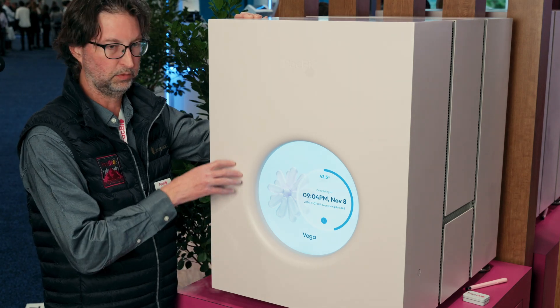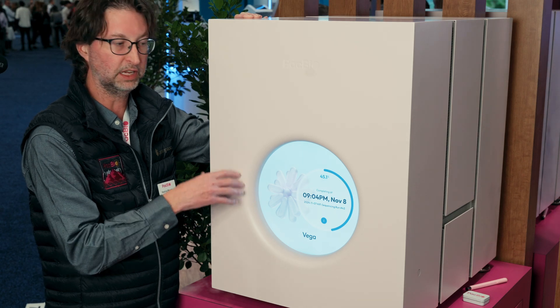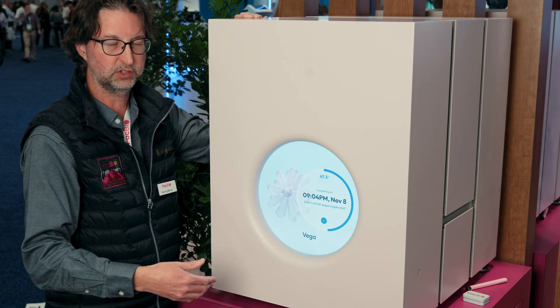As soon as it's done getting the cell sequencing, the used consumables can be removed — it'll let you know. You open the drawer, take off your used consumables, put the new ones on, and you can run this thing 24/7, 365.